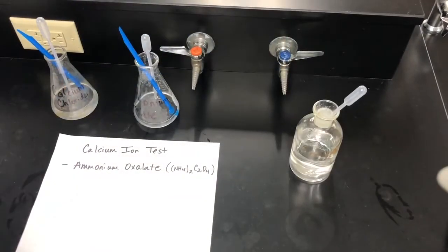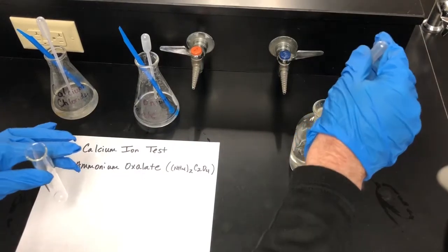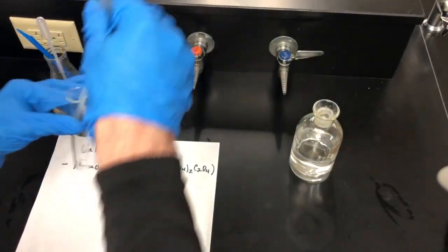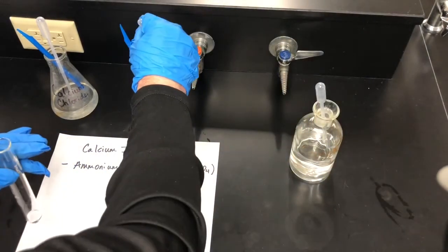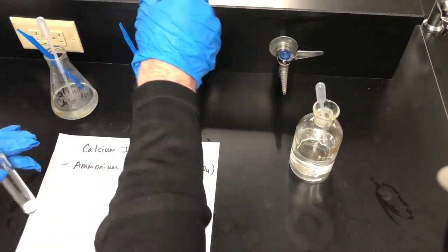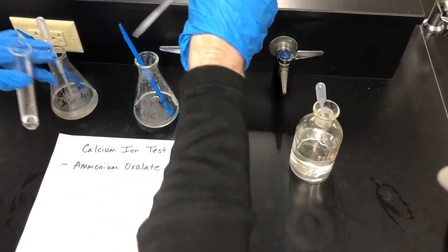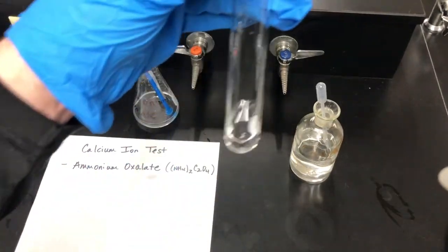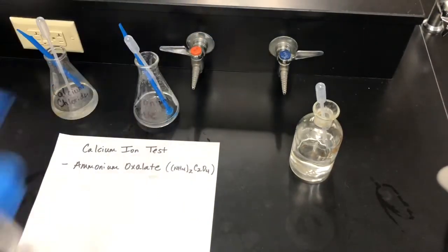So we'll come back and we will use our unknown to test it for the calcium ion. Still using unknown number 24, we're going to take 1 to 2 milliliters of that. So we'll take a squirt of that, and we're going to mix it with some ammonium oxalate. Okay, if it's positive, it should make a white cloudy solid. And as you can tell, it does not. So it's going to be negative for this ion.